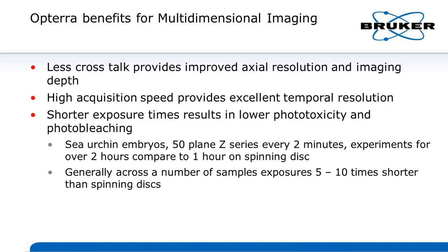And that's true of both basic time-lapse experiments where people are running at a single focal plane at a maximum rate of speed, but as you'll see, in combination with the piezo focusing device that we use, we can achieve high acquisition speeds in four-dimensional data acquisition paradigms also. And the shorter exposure times result in lower phototoxicity and photobleaching.